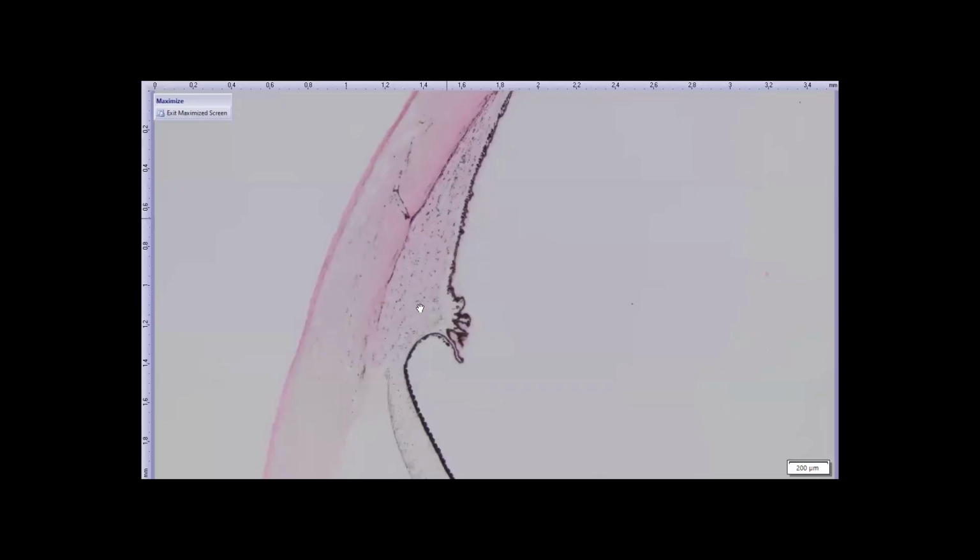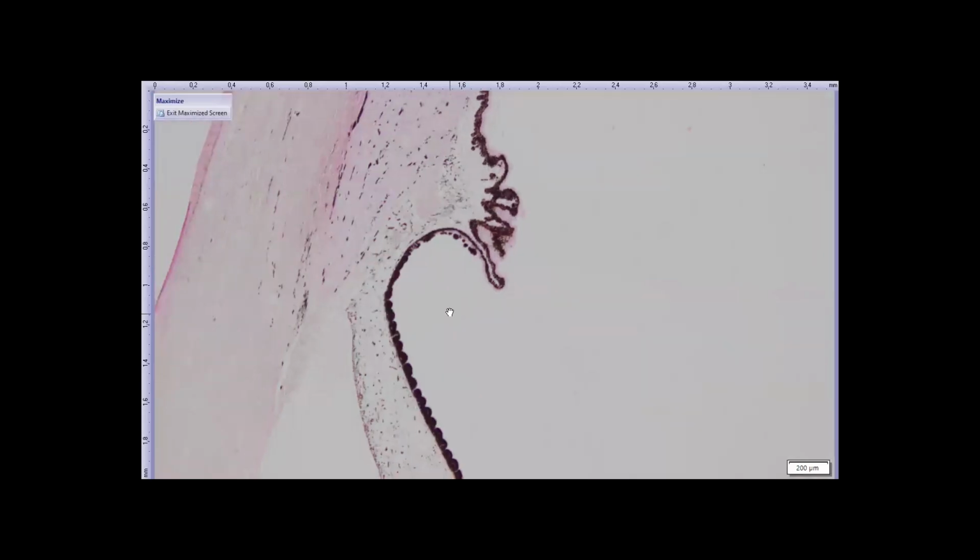We looked at the ciliary muscle from a primate before, but it has this rather big ciliary muscle, and we talked about accommodation, how this posterior aspect of the ciliary muscle drags this soft tissue forward and closes this area, making the aperture which supports the lens smaller, which means that the zonular ligaments become less tense, which provides an opportunity for the lens capsule to cause the lens to be rounder for near vision accommodation. But I wanted also to show that this is Schlemm's canal.